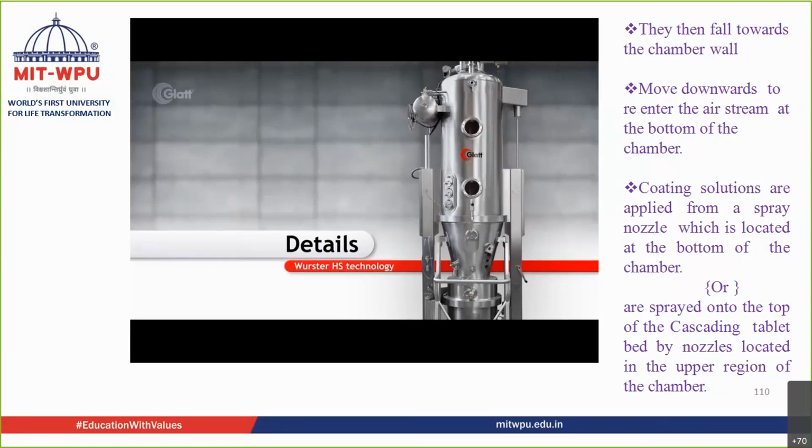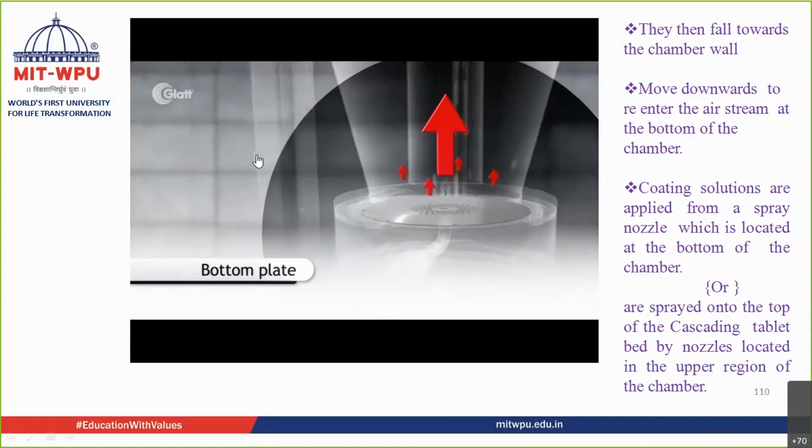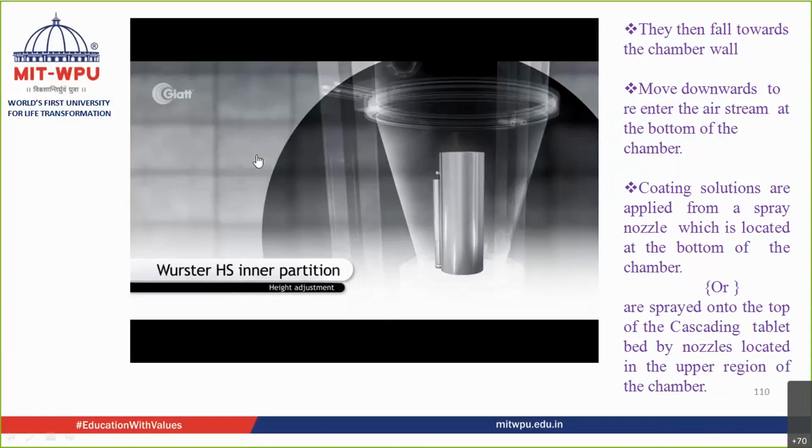This is how the liquid is sprayed. So you have hot air along with the solution. If it is sprayed, then what is going to happen? It is going to come in the form of atomized particles.